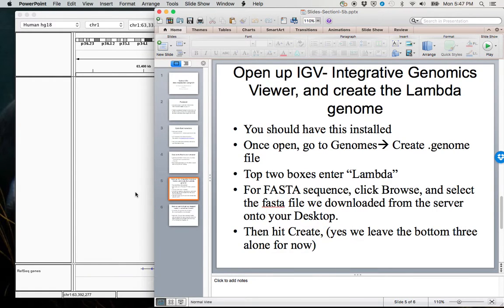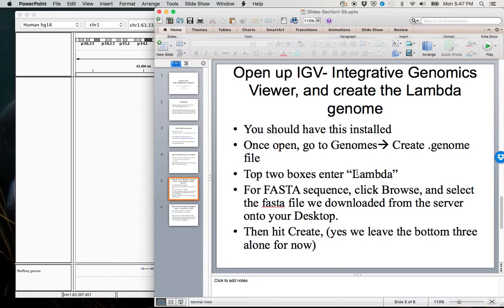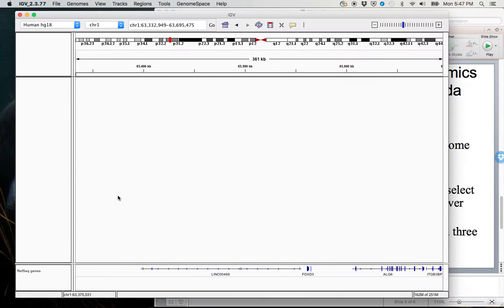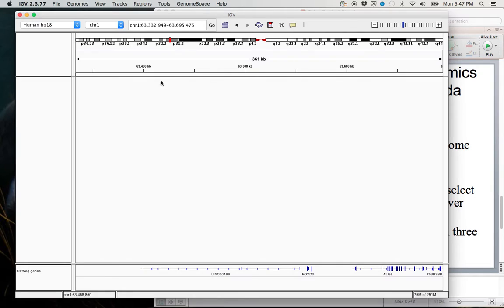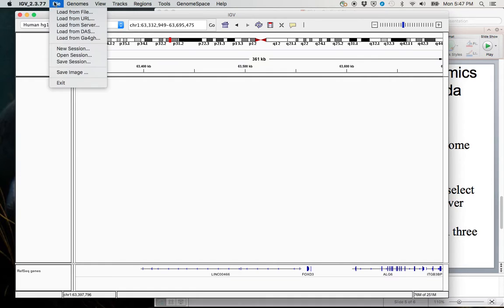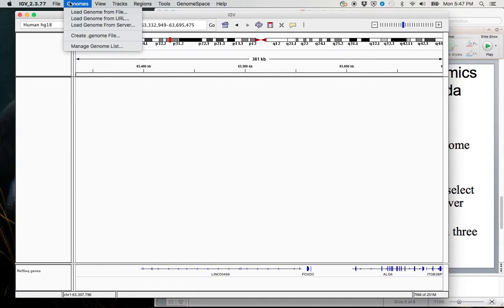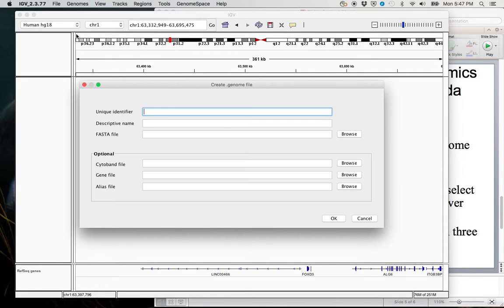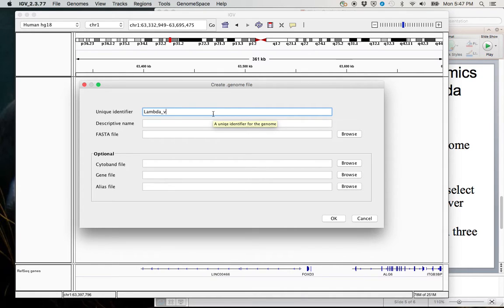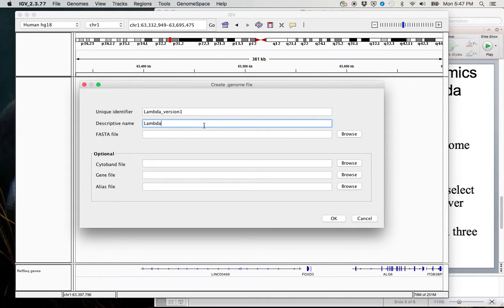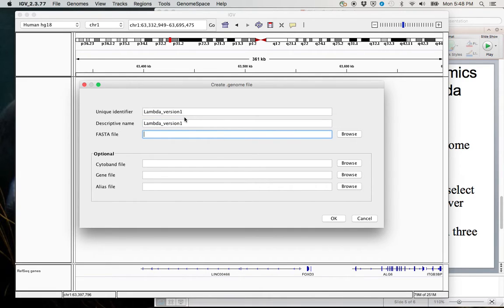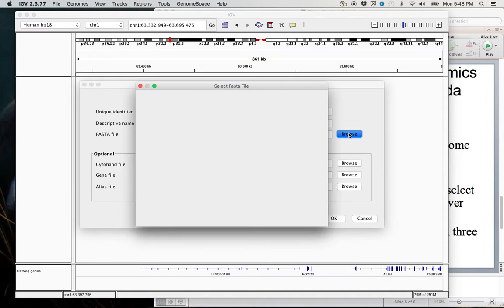However, our toy example for this data visualization that we just mapped in the previous section is for the lambda genome. So if we tried to view the lambda sorted BAM file here, the coordinates wouldn't match up with the human genome and there would be an error. So instead, what we need to do is we need to create a new genome. And so these are called .genome files. So we're going to create a new one and we'll call it lambda. We'll call it version 1. Descriptive name. Sometimes I just make these the same. There's really no difference between them.